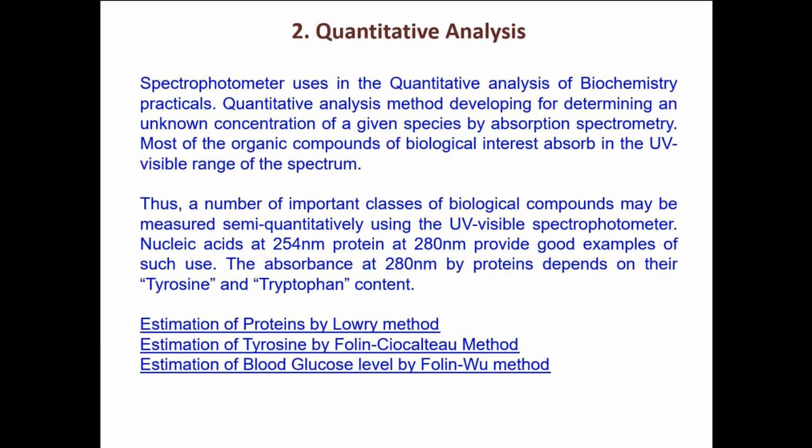Let me tell you why it is zero. The solution has lactate, NAD, and lactate dehydrogenase. Because the machine is fixed at 340 nanometers, it measures only the optical density at that particular wavelength.